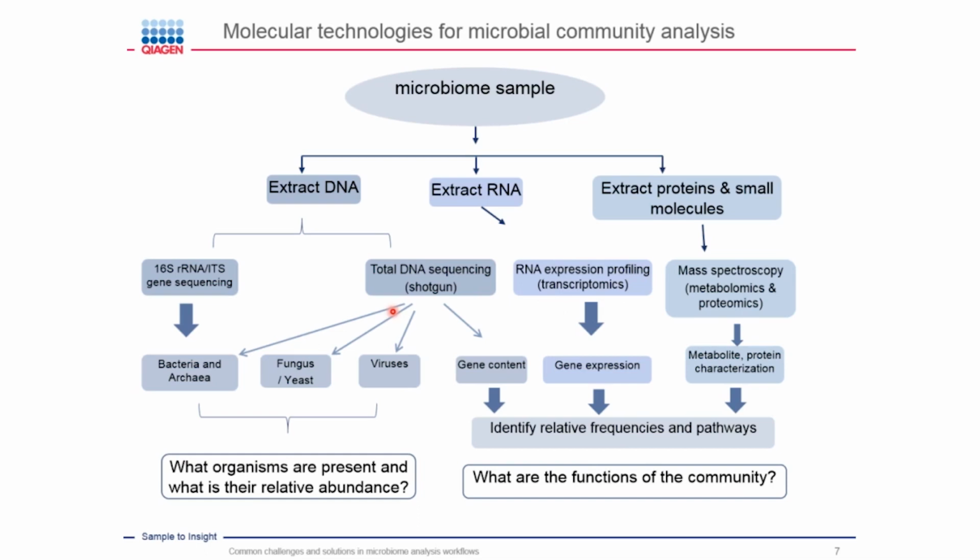Currently, the standard workflow to identify the diversity of a microbiome sample is to sequence the DNA. You can do this by DNA sequencing of a shotgun library. This will give you a lot of answers, and it is not restricted, for example, to bacteria. You can look for bacteria, archaea, viruses, and all other DNA in one run. That's on the other side also the point which is perhaps not optimal. If you have a lot of human DNA in there because you have a stool sample or something, you will also sequence your human sample.